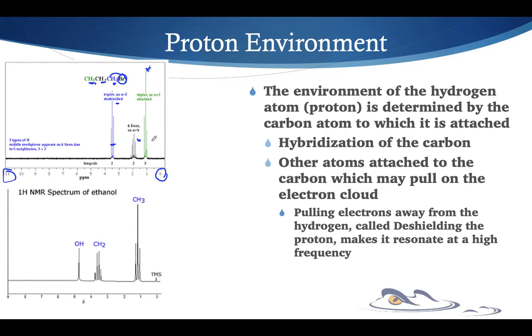And then let's take a look at ethanol. And so you can see ethanol is CH3. Whoops, that didn't come out a very good 3. And then CH2, and then there's an OH attached to it, right? And so the CH3 here, you'll see they have that pointed out right there, okay?